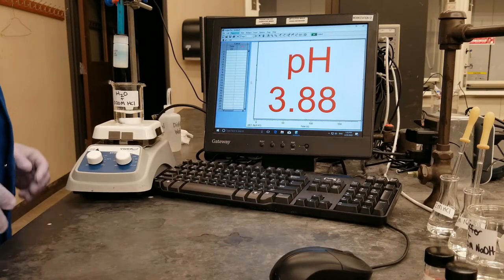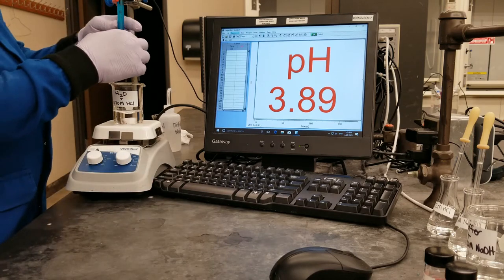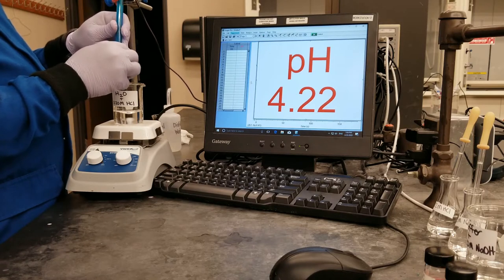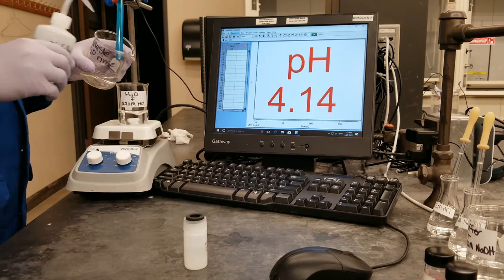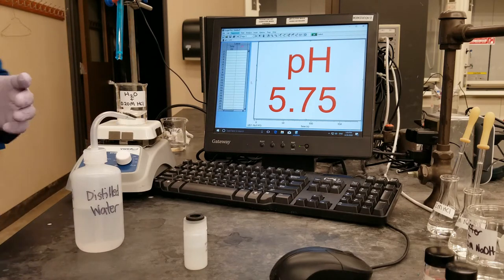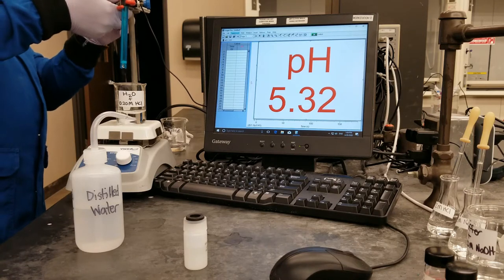So to begin the experiment, I am starting with the water solution that I am going to be adding hydrochloric acid to. I am going to lower the pH probe into the solution so that we can measure the pH. But before I do that, I am going to rinse the probe to make sure it is clean, and then I am going to wipe down the probe itself, and then I will lower the probe into the solution.